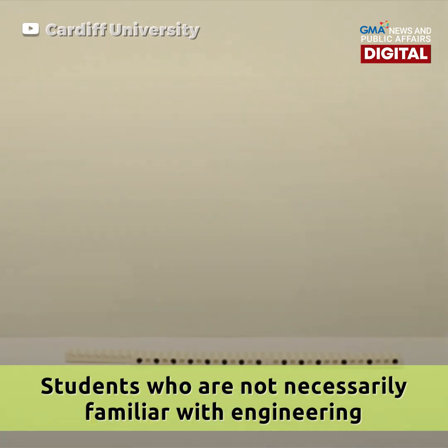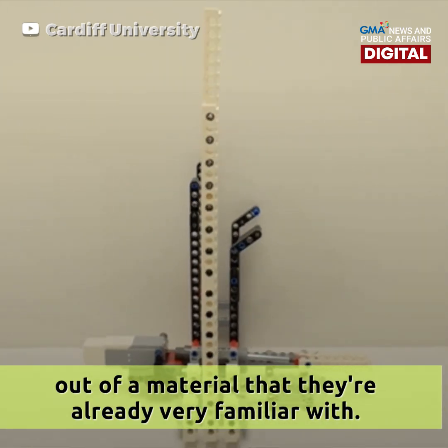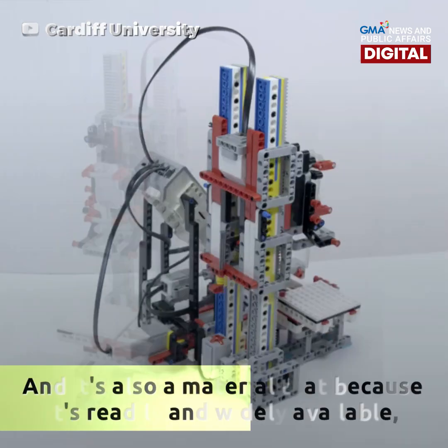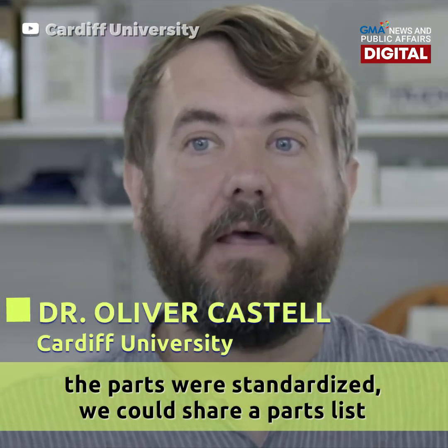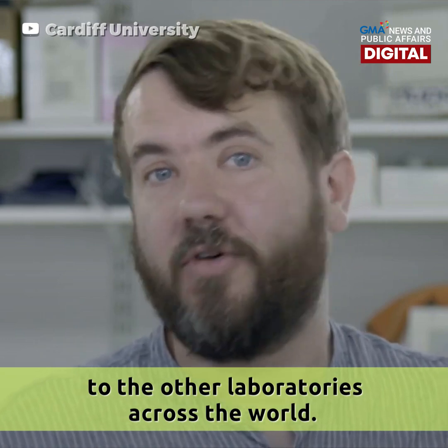Students who are not necessarily familiar with engineering can get their teeth into building a machine and a robot out of a material that they're already very familiar with. It's also a material that, because it's readily and widely available, the parts are all standardised, and we could share a parts list to the other laboratories across the world.